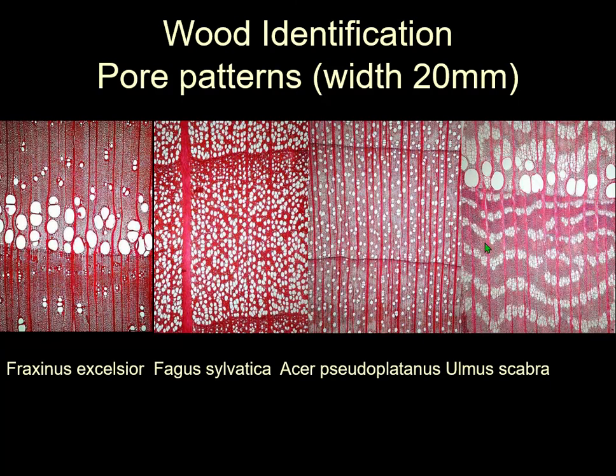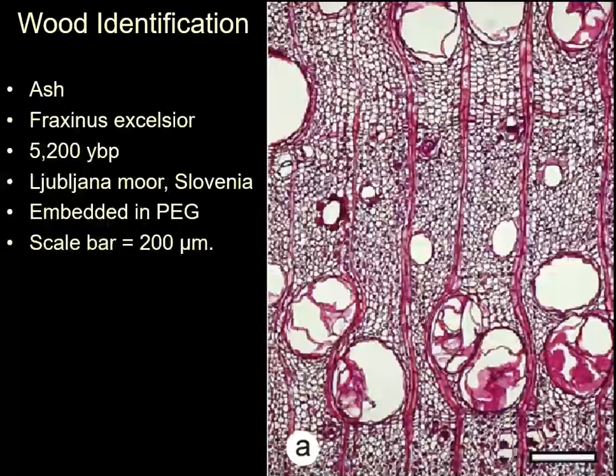And you can quite often see distinctive patterns in wood. And you think, oh, for instance, you can probably easily tell the difference between oak and pine if you've ever looked at wood at all. But every type of wood will have a distinctive pattern, which you can clearly see in thin section. And here's some archaeological wood identification using thin sections.